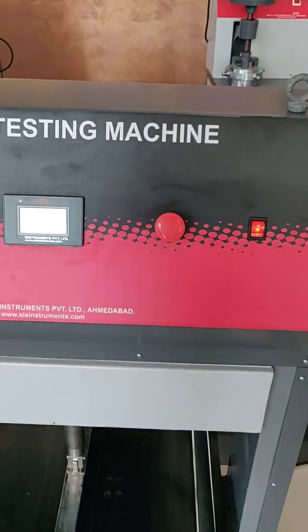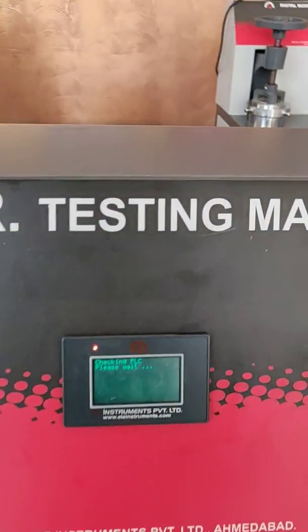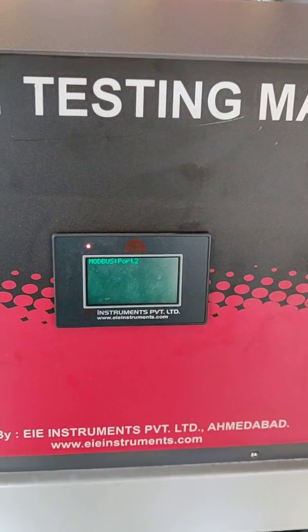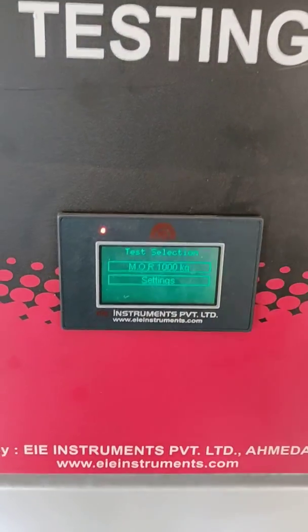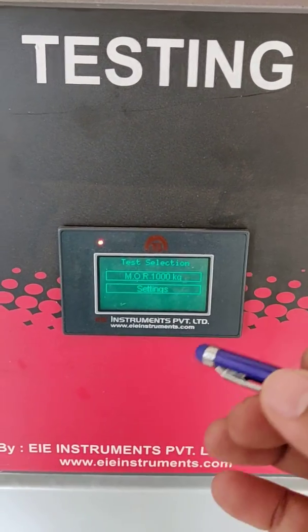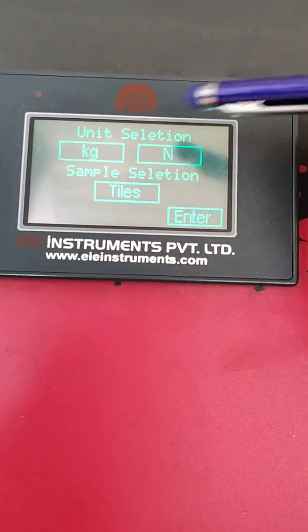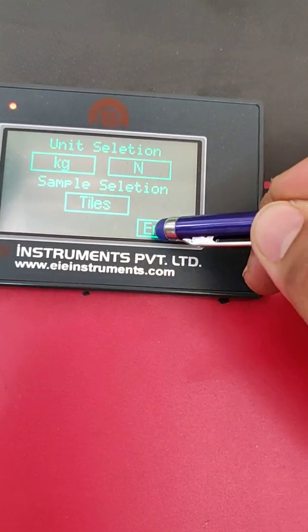Switch on the machine. This is the system data screen — press anywhere to get into the main screen. Here you have to select M.O.R. 1000 kg. Select the unit as kg, and our sample type is tiles. Press Enter.